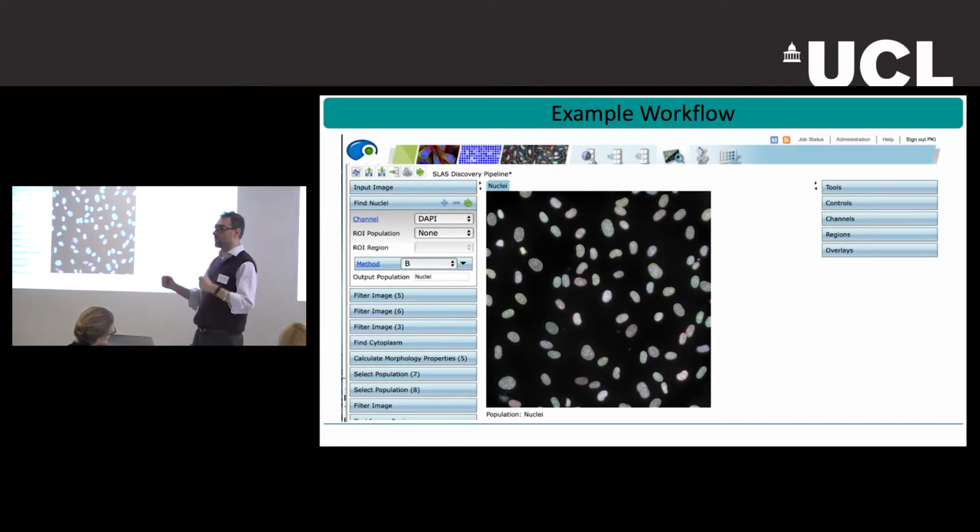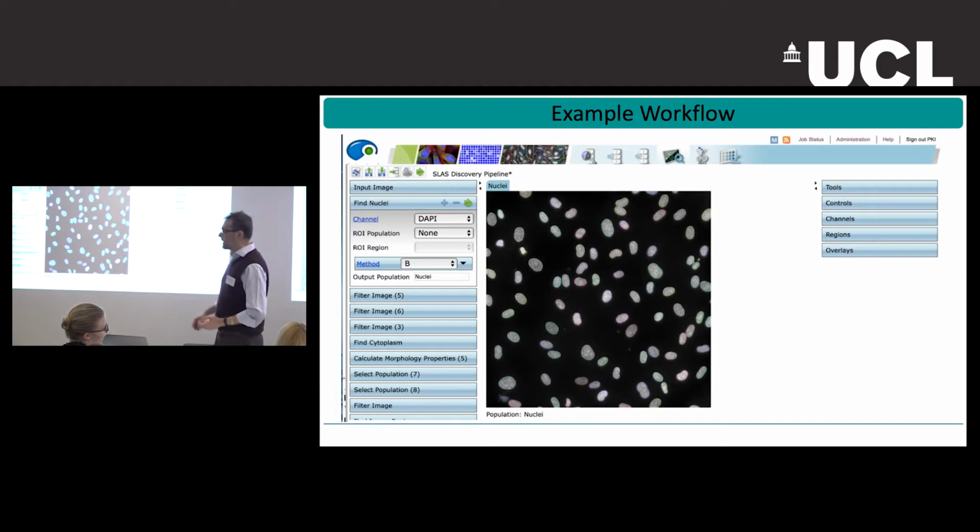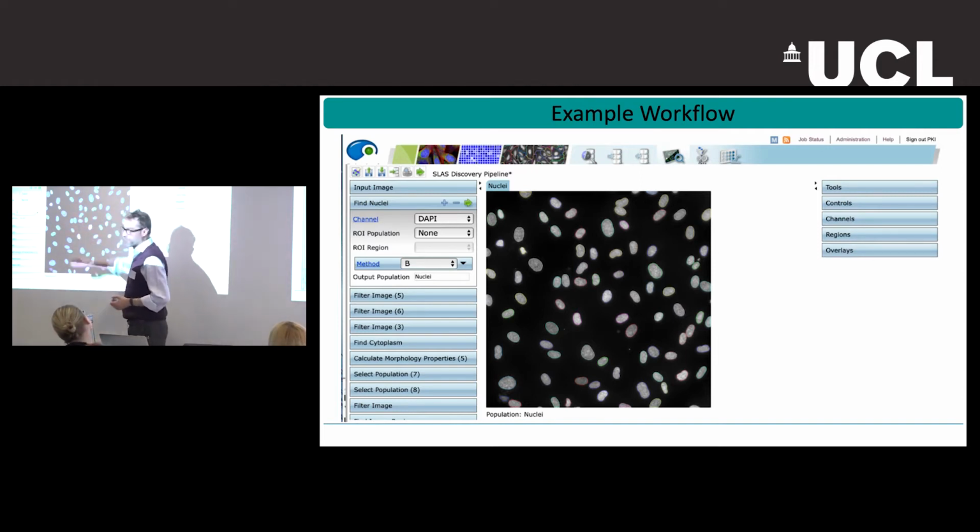Basically they are the same software. One is running on a machine, one is running on a server. Davide, correct me if I'm wrong. They do mostly the same thing, which is giving you a sequential system, so you can add modules to your pipeline and make the pipeline do something for you.